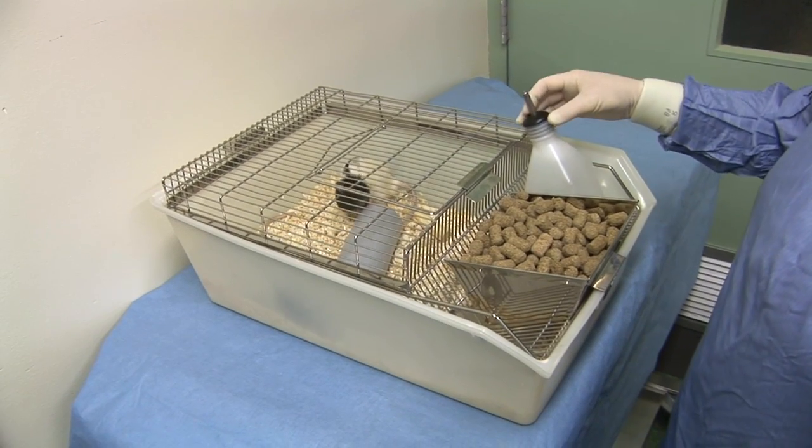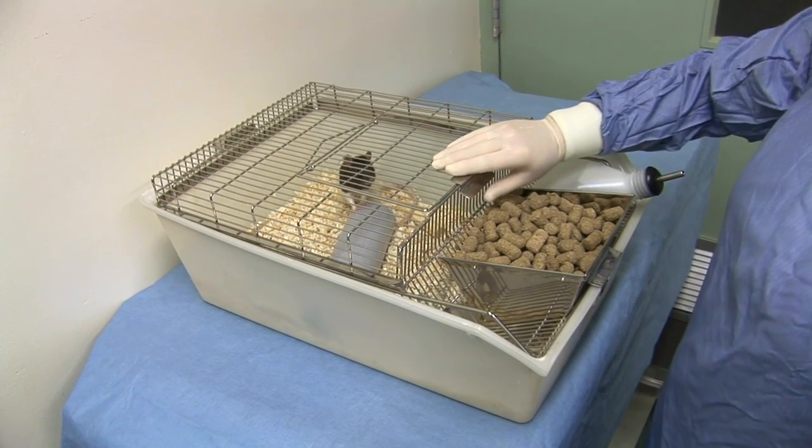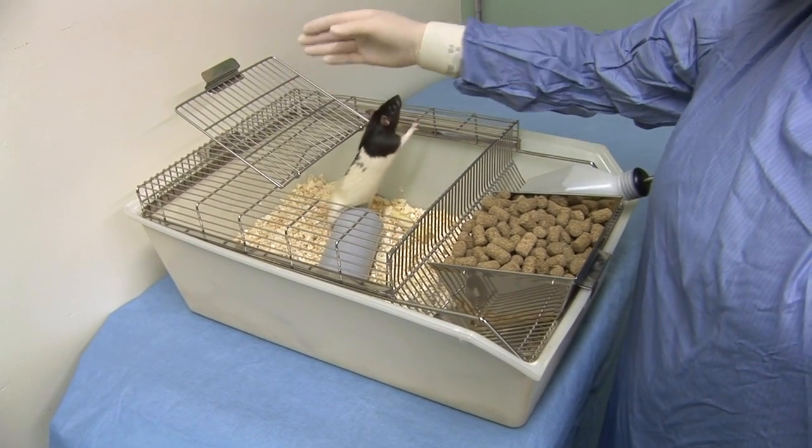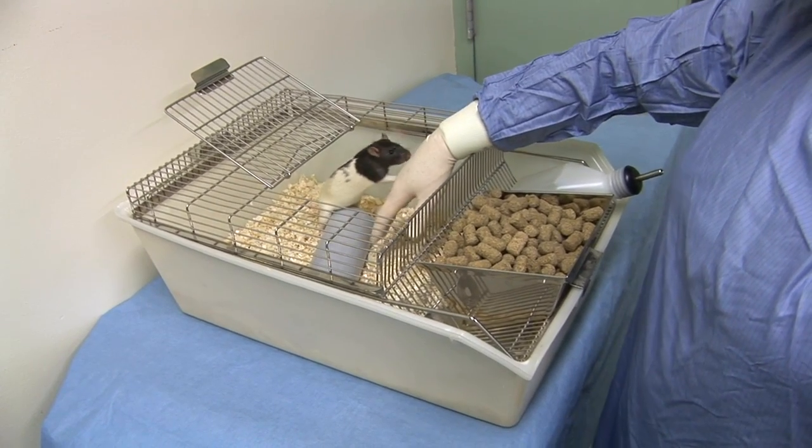The cage top should either be opened or removed carefully to avoid excessive disturbance to the animals. The rat should be allowed sufficient time to become aware of your presence.